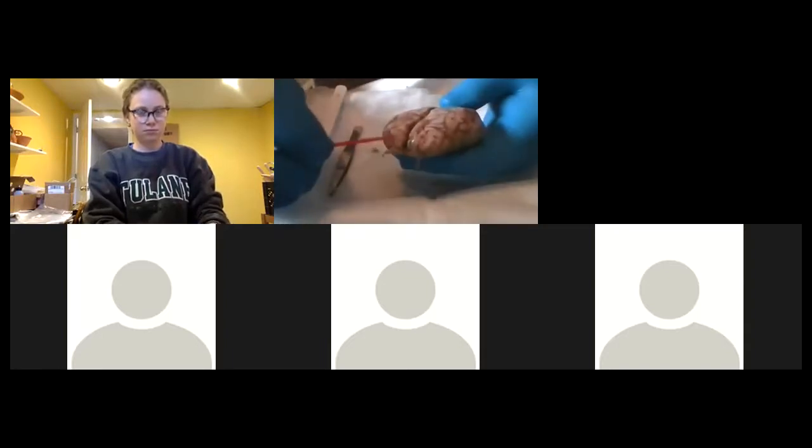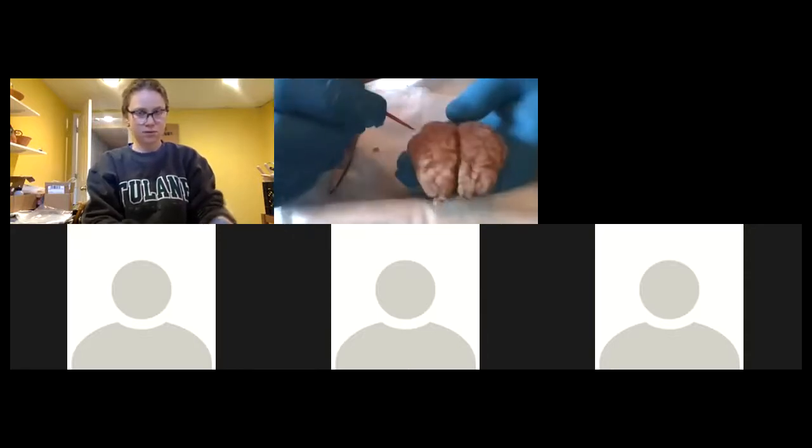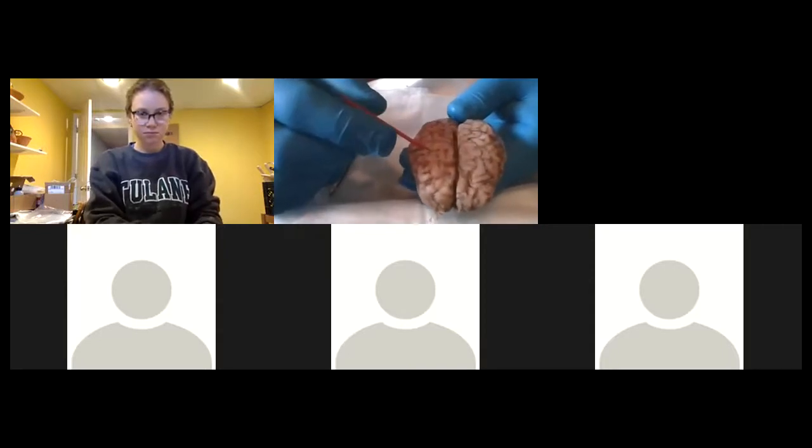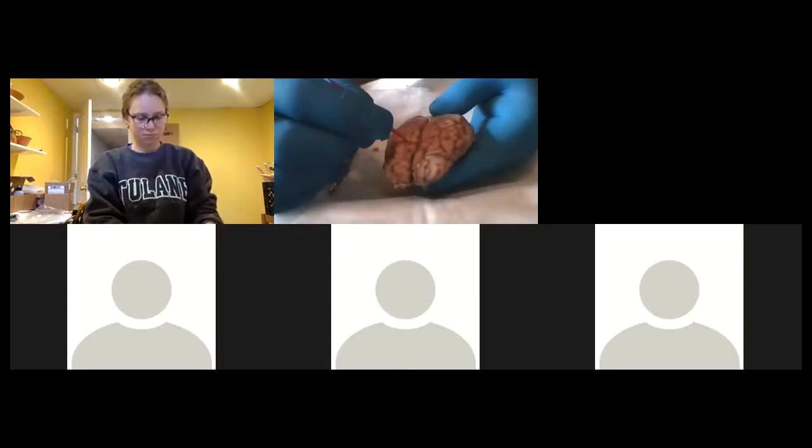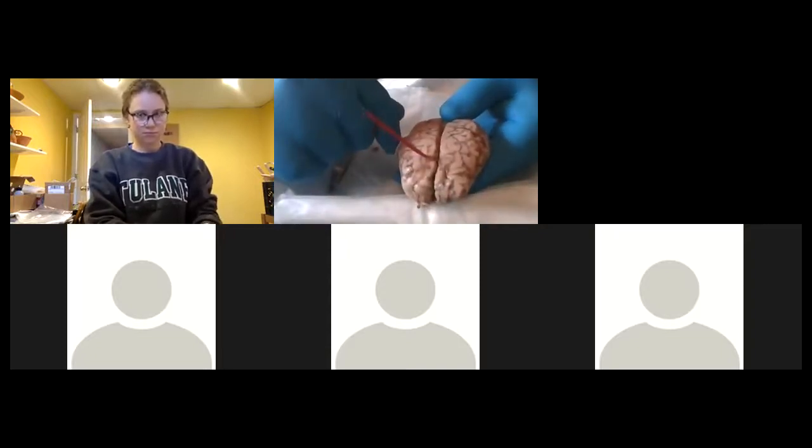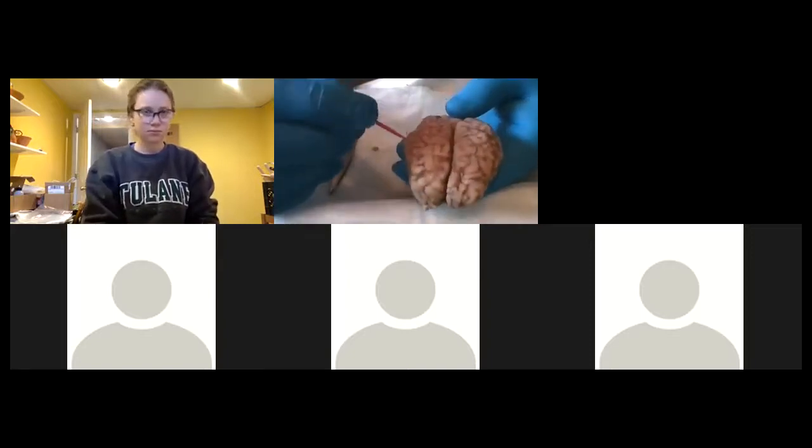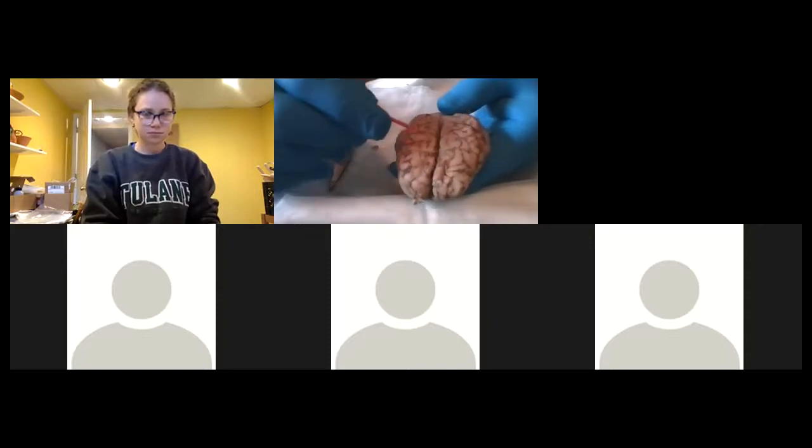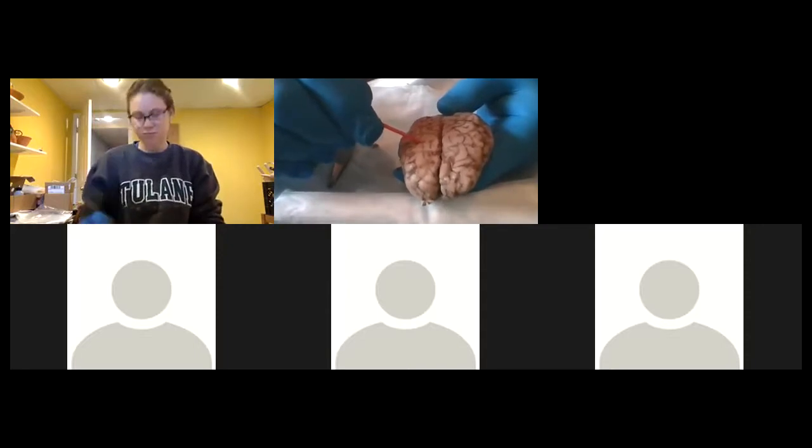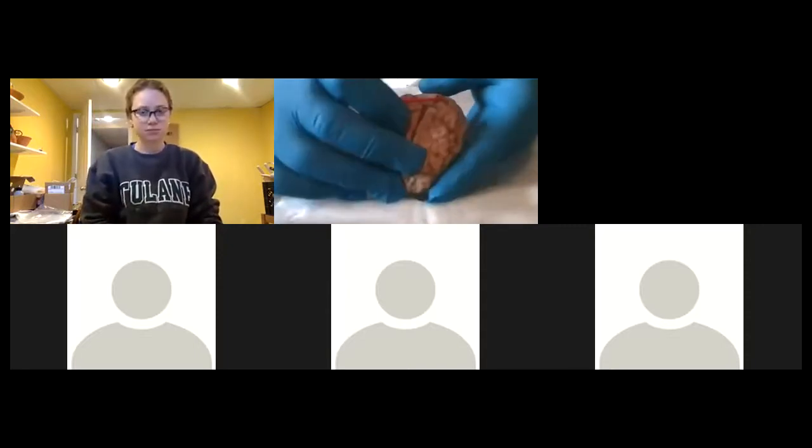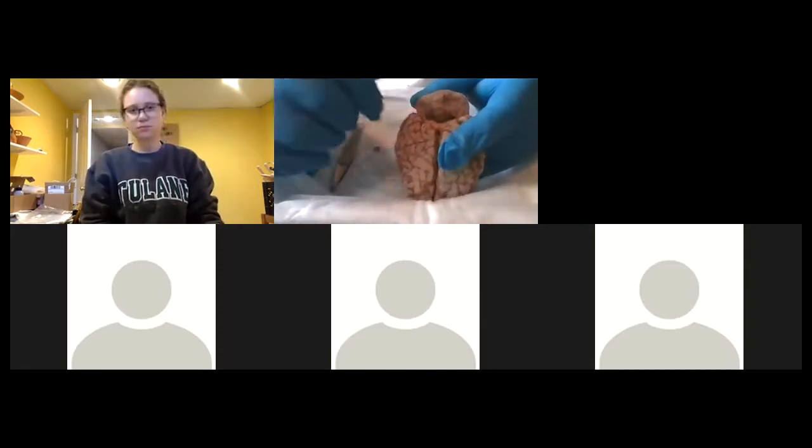So now you could see the frontal lobes, like this is the right frontal lobe. Left parietal would be back here. Right parietal, left parietal. And this sulcus in here, you'd be able to see a central sulcus between the frontal and parietal, right side. And of course, you could notice the gyrus, the hills. You could see where the sulci are, the valleys.